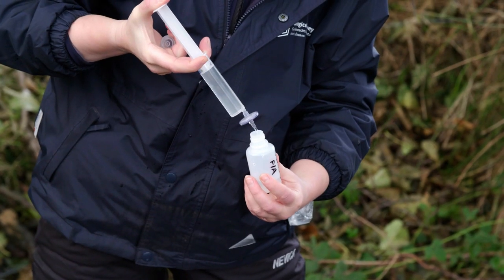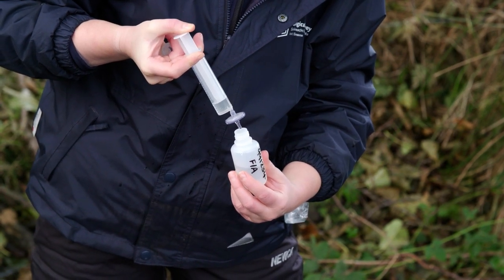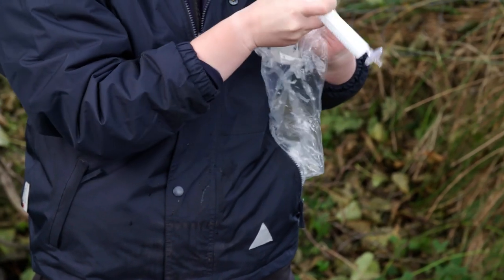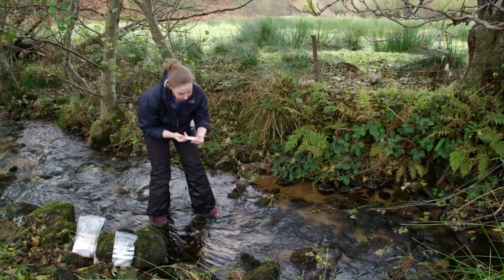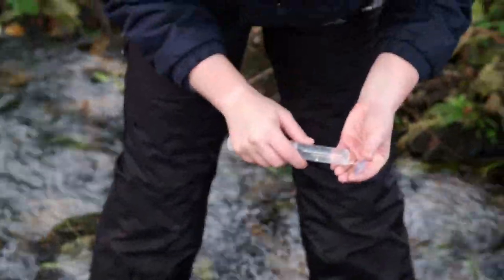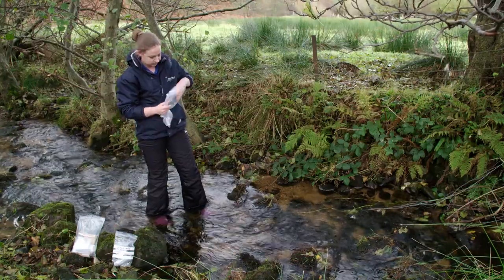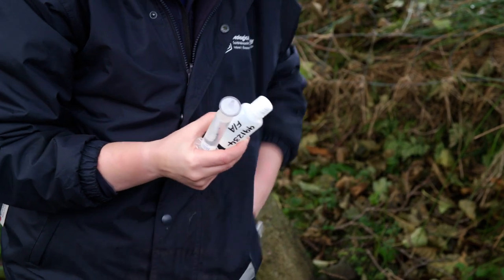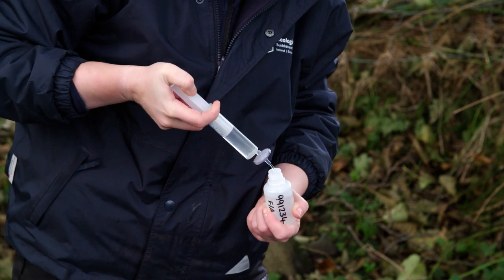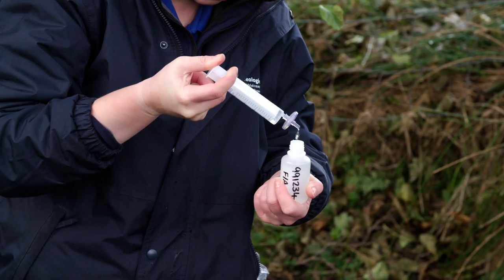Continue filling the bottle. If at any stage it is becoming harder to filter the water, do not brace the filter against the neck of the bottle in order to force water through it. This may rupture the filter membrane, meaning water collected is not screened to the correct fraction. Instead, switch to a second filter. Always draw up the stream water from a few centimetres below the surface flow. Ensure that samples are taken from where the water is actively flowing and avoid sampling water that has become cloudy where the stream bed has been disturbed. Fill the FA bottle to just the base of the neck and secure the cap tightly.